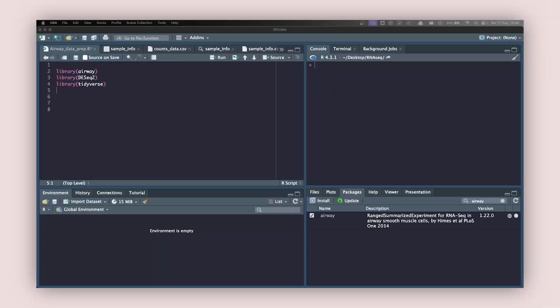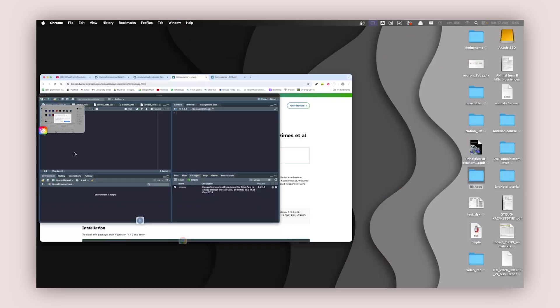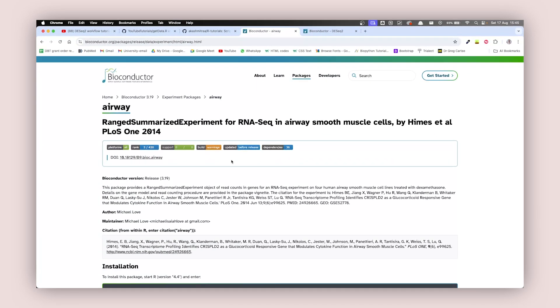We are going to start with the RNA sequencing analysis. But before that, we need to get a dataset on which we are going to work. That dataset is the airway dataset — it is a summarized experiment object, that's what they call it in R. You can go to Google and search for the airway package for R.